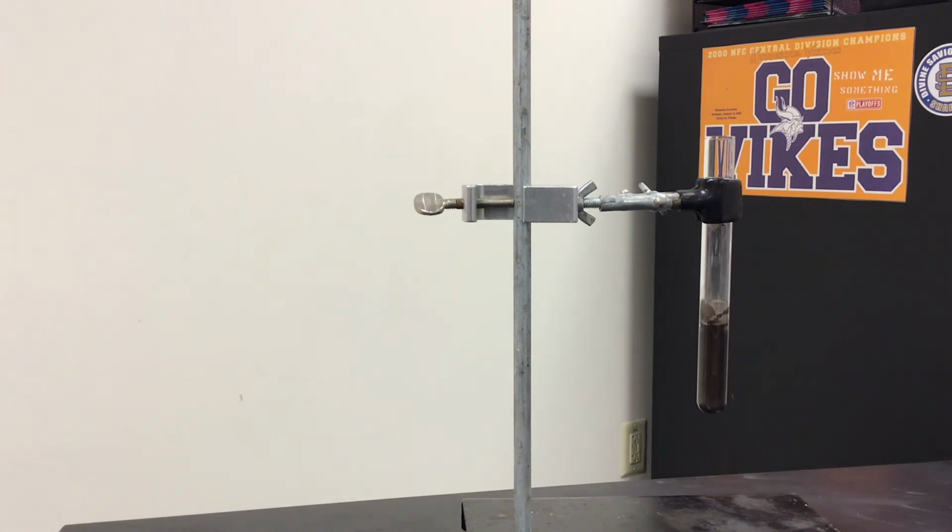So as you can see, it's still fizzing up, and you can see there is the cloudy gas that you've seen. So what we said should be oxygen. We can also test it out by just using a wooden stick.